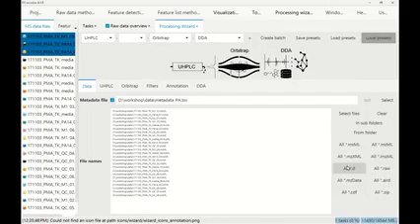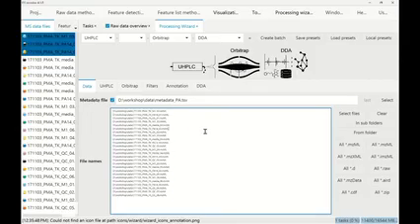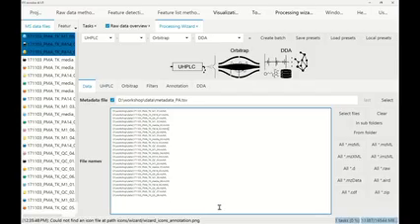And I can load a preset here. The only thing that you have to do now is mention all the file names here that we want to process. In the beginning, it's sometimes good to just use a smaller set. If you have hundreds of samples, maybe you only use 10 of each different batch and put them together and process a smaller data set first. Optimize your parameters, and then in the end, process everything.